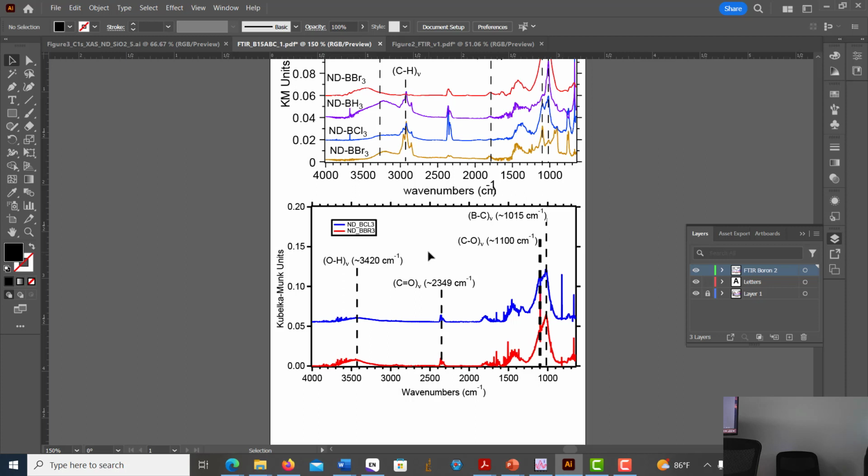Now again, because of layer 1, and let's say I lock out letters as well, the only thing that I can screw with at this stage is within this area. Nothing over here. I may be able to get a little bit of data, but I can't do any active work on that section of the image. I hit Control S, making sure to save that. And we're ready to go.